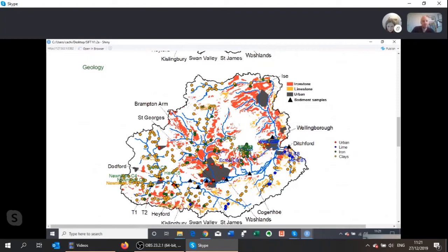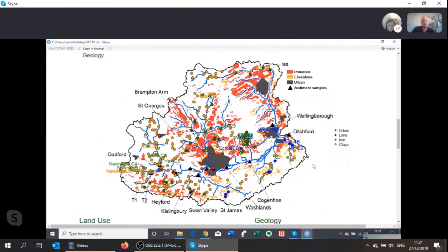These three. Yeah, so what we want to do is reclassify those and say that we've actually called them the wrong geology when we sampled them, so we're going to change them to actually be limestone. And I think it's important to only do that reclassification if you can provide a very robust reason why, which in this case we can. We just don't want to reclassify anything that it thinks is wrong, because we'll end up with a nice result which isn't representative.